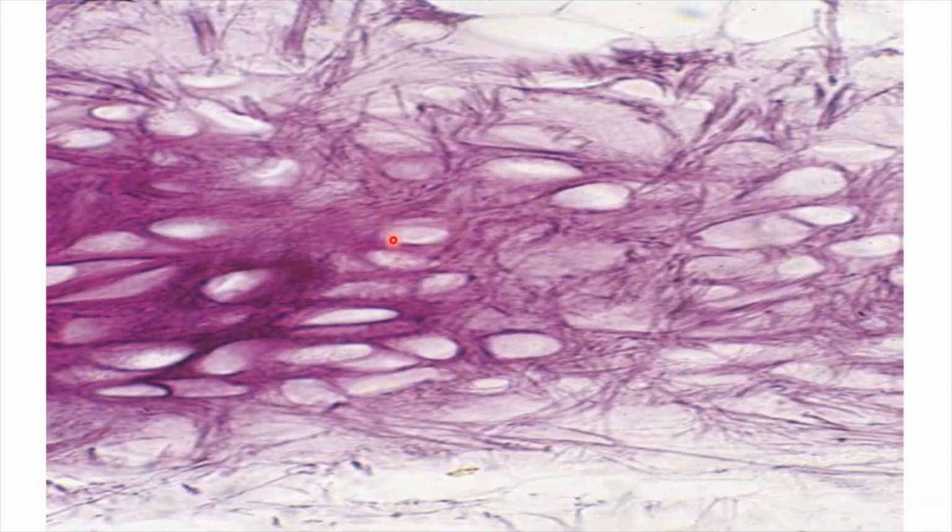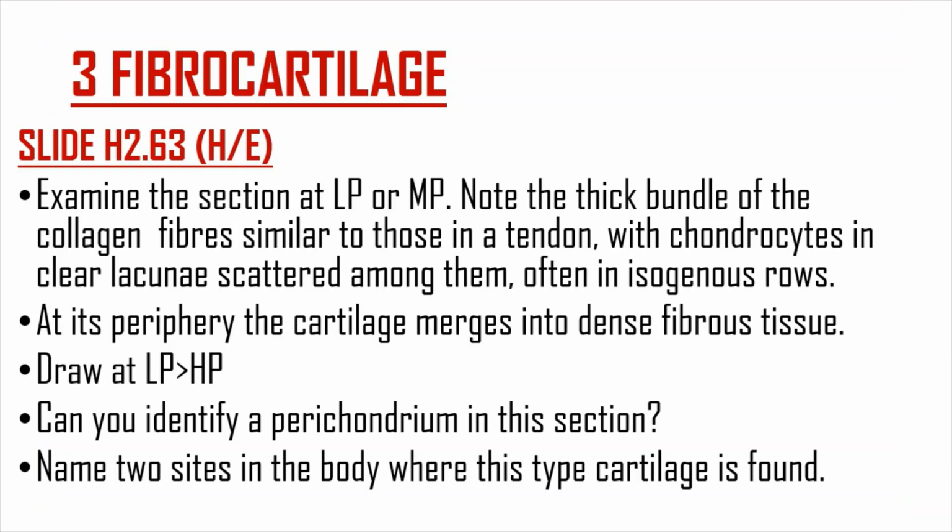And this diagram also shows elastic cartilage. These are the elastic fibers here. Okay, so this demonstrates the same thing as we were looking at in the other slide. Now let's look at fibrocartilage.